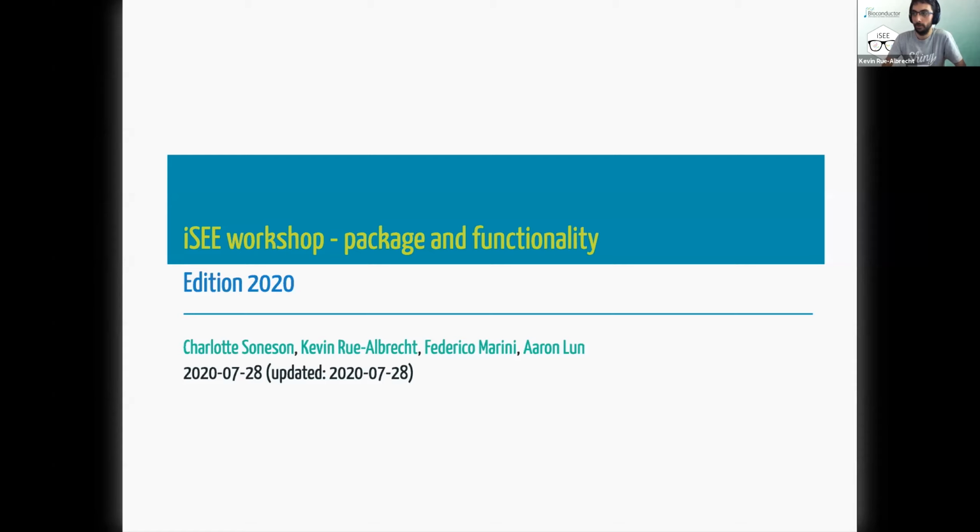So we're going to describe today the package and the functionality. This is the 2020 edition. The package was started in 2017, so we've got quite a few features to cover. And I'm glad to present this with Charlotte, Federico, and Aaron.